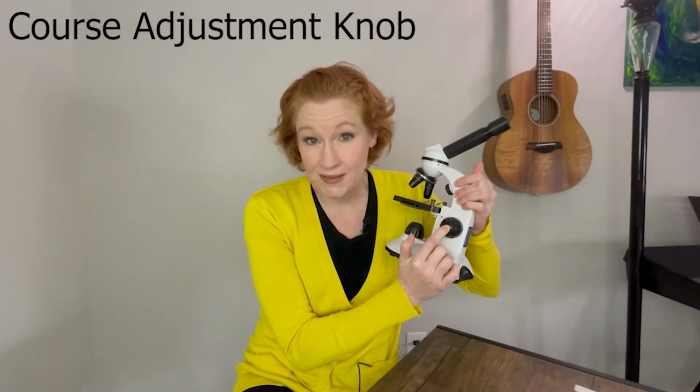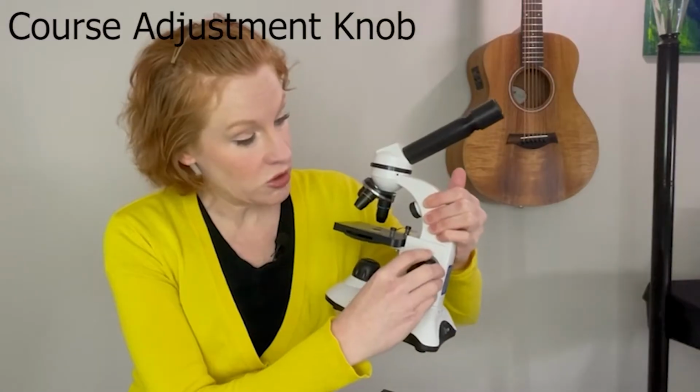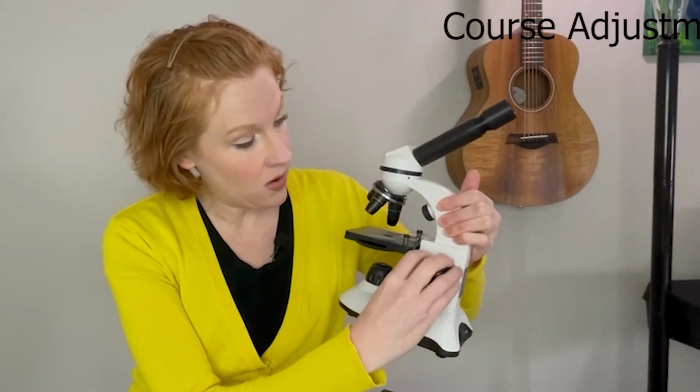Then here, this is the coarse adjustment knob. This is what you use to zoom in and out. Some microscopes have a second one of these, which is the fine adjustment knob.